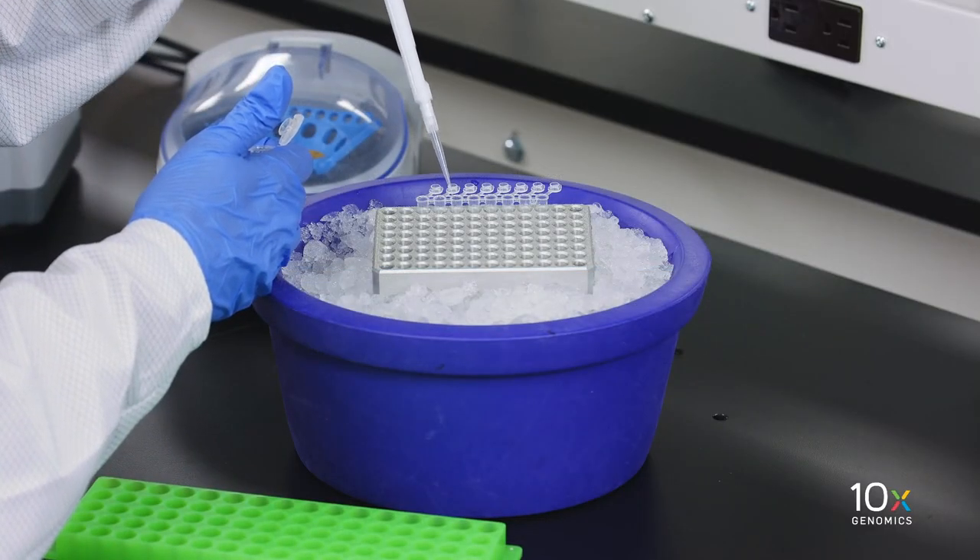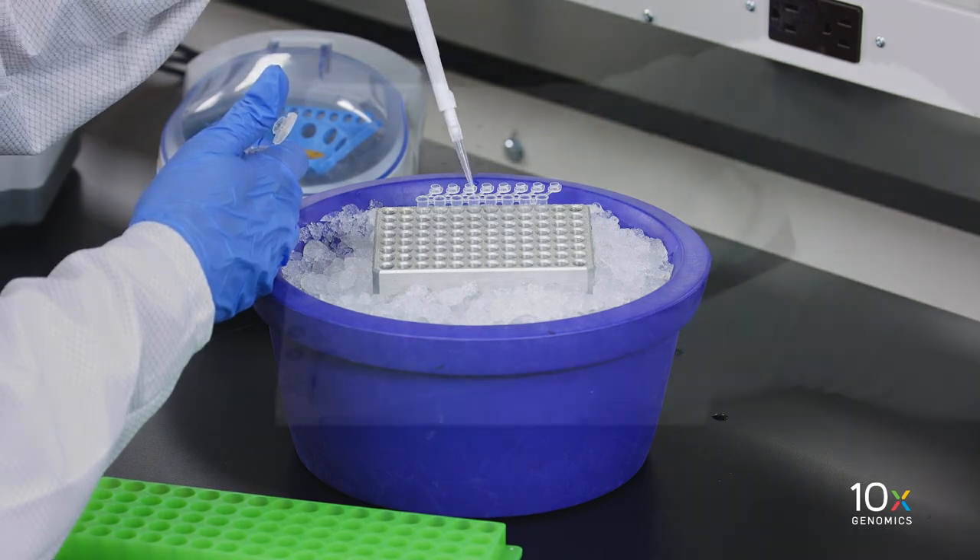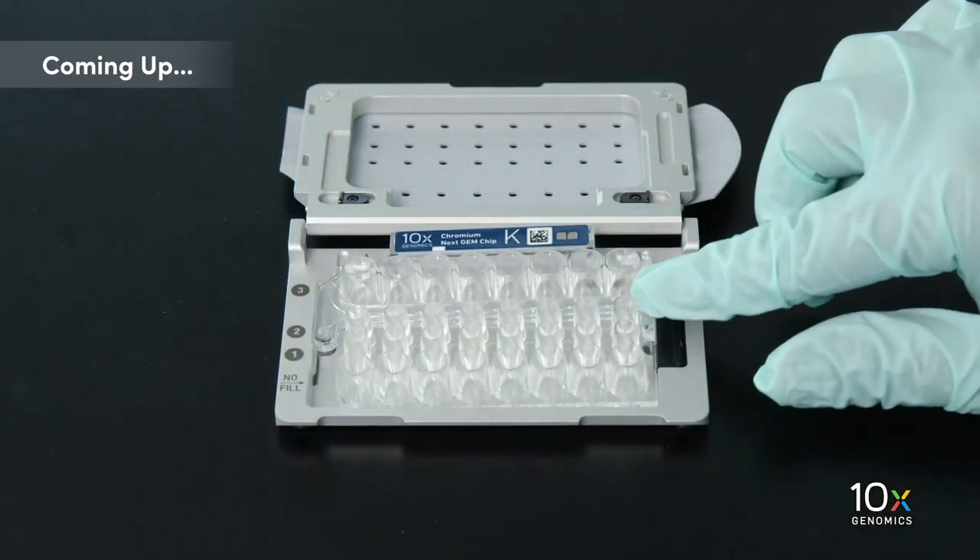Then we aliquot the master mix into each tube of a PCR-8 tube strip on ice. Next, we are ready to assemble the chip.